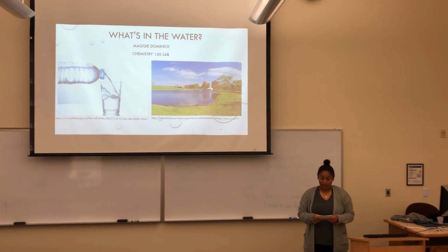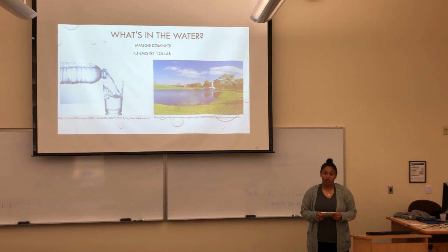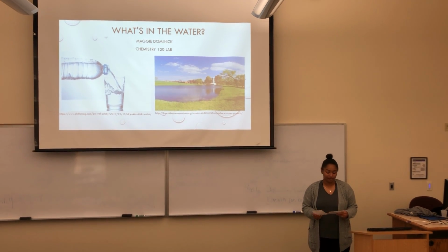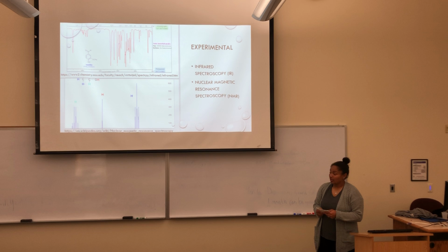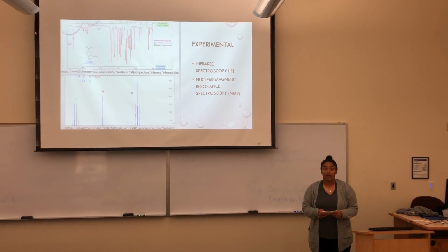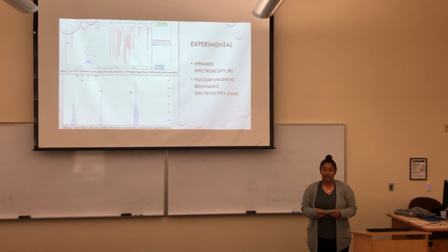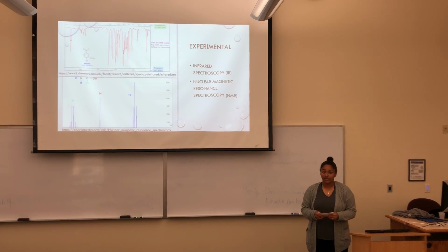My name is Maggie Dominic, and the purpose of this experiment is to identify unknown compounds found in drinking water samples supplied by contaminated water. Determining the unknown compounds can be achieved by using infrared and nuclear magnetic resonance spectroscopy. Using the equipment given in the lab, the IR and NMR spectra could be obtained.